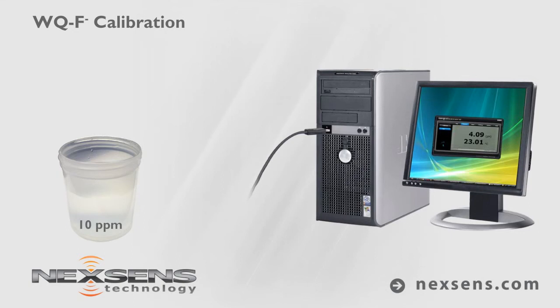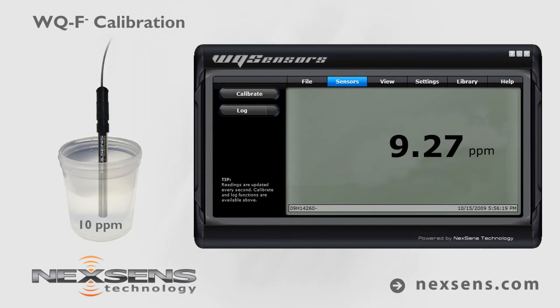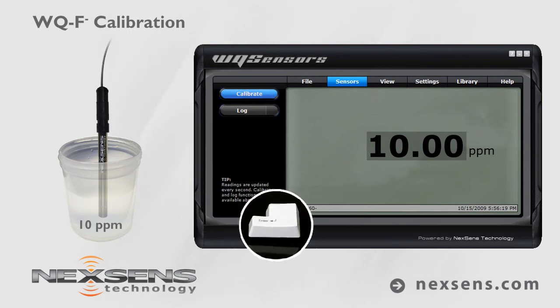With the sensor connected to your computer and the software running, submerge the probe in the 10 parts per million standard. Allow the reading to stabilize and press the calibrate button. Adjust the value to 10 parts per million and press enter.